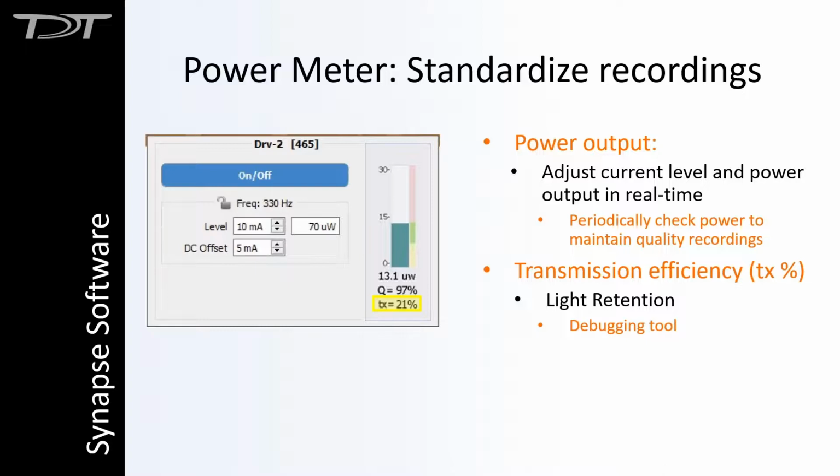And the same thing with the power. You can periodically attach to the power meter and say, all right, 21% is what I had last week. Do I still have 21%? All right, very good. The system is performing the same as expected.